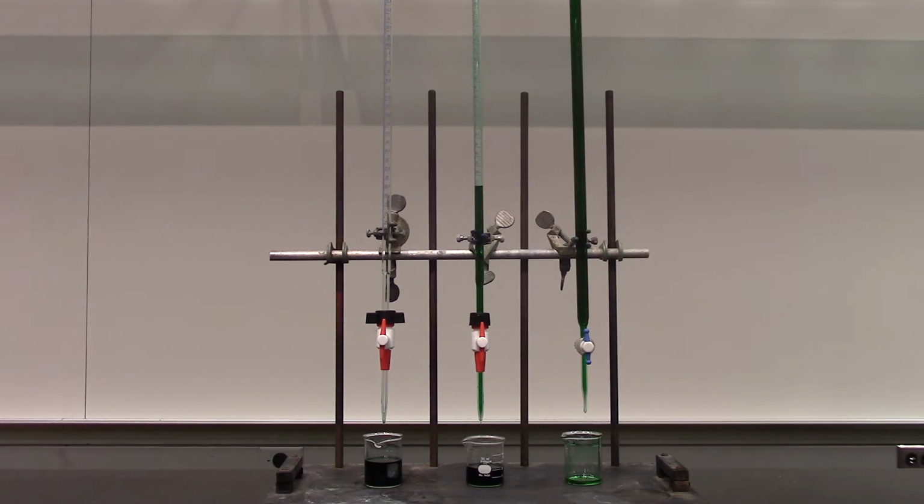As the ethylene glycol burette finishes draining, we notice that the levels of the glycerin have barely budged at all. Rather than filming this, we'll just note that it would take about 5 to 7 hours for this burette of glycerin to fully drain.